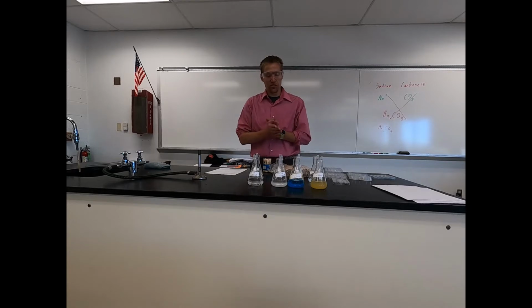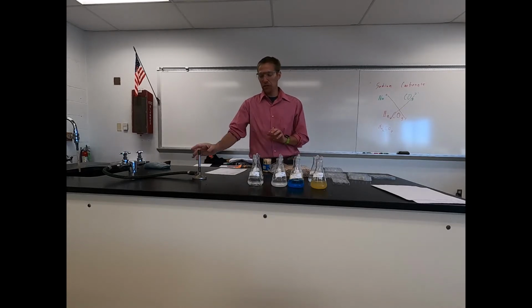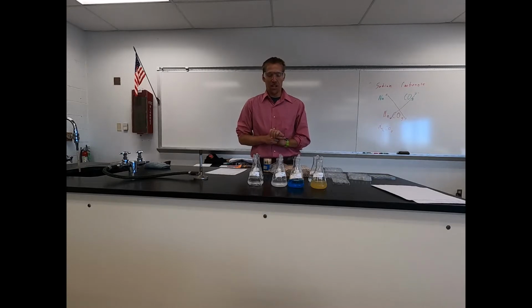Some of these reactions should produce what we call a precipitate, and then we're going to use our flame to do a flame test to see what is left in the liquid and help us identify what that precipitate is. So let's go ahead and get our well plate and get rolling with this.